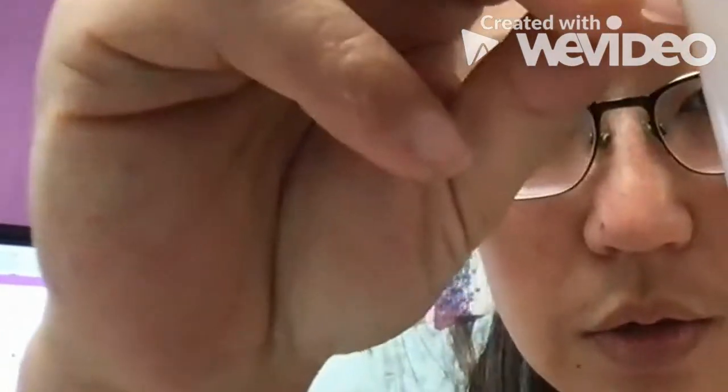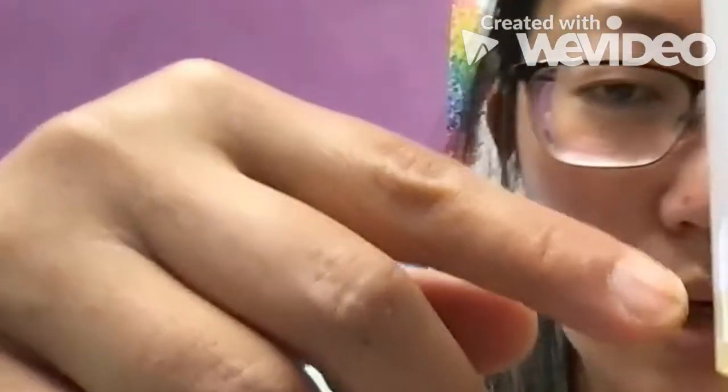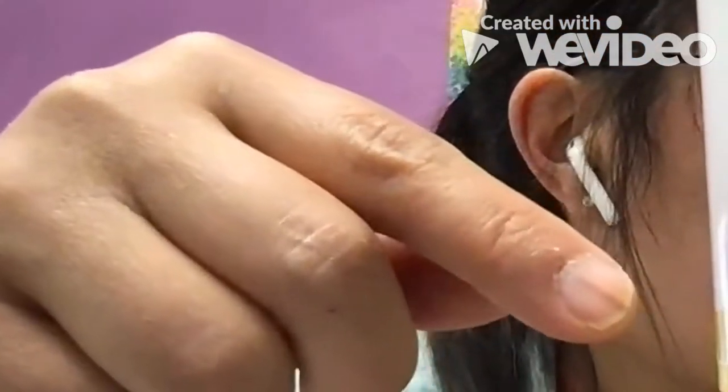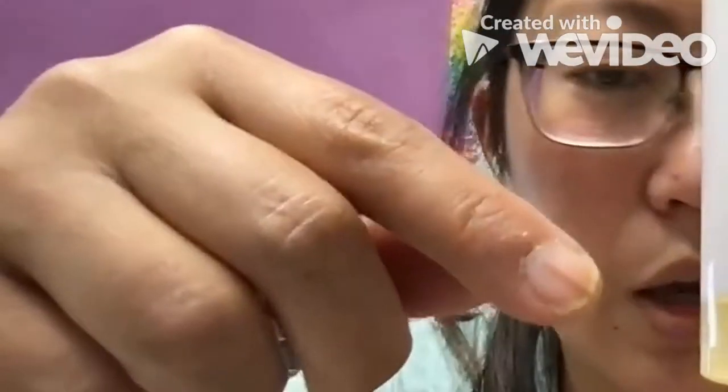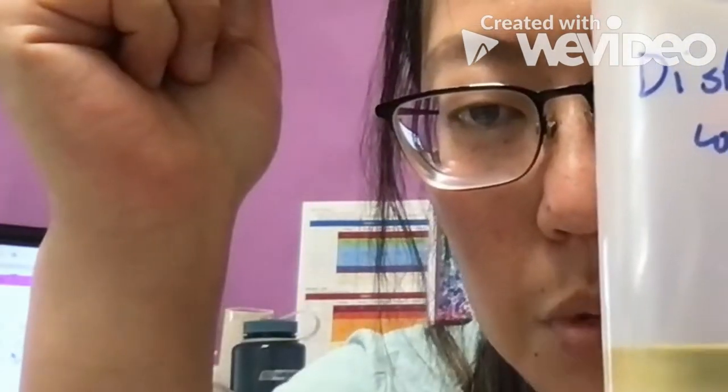All right, so then the final thing to do is to look at what the solutions look like when we add universal indicator, and I've actually already added the universal indicator into these. So the distilled water, you can look at the color. This is for pH using universal indicator, and then in that column, there's a chart that has a link. You can look at the color and match it to the color you see on the chart, and then give the pH. So that's distilled water.